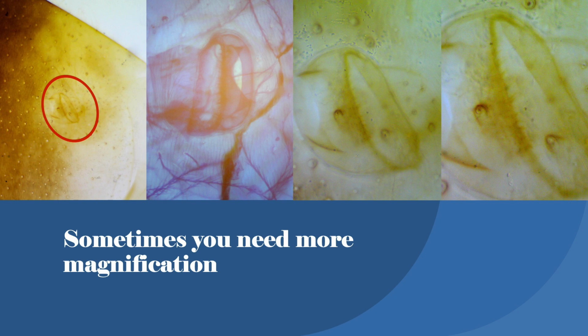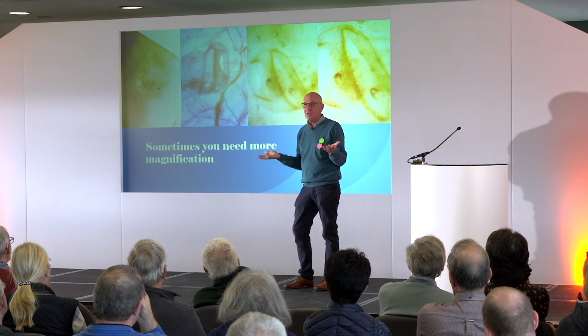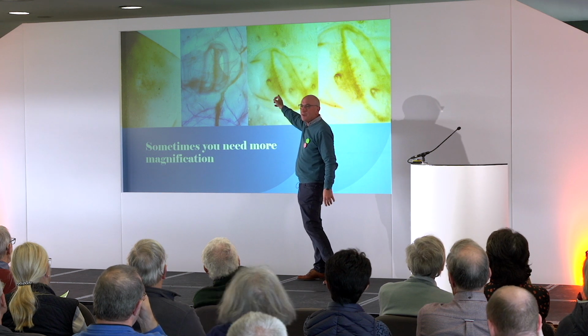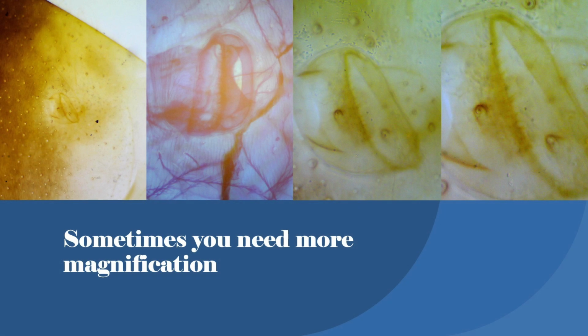The amazing thing is, when you look at a bee, we all know a bee is hairy, but hairs grow everywhere. They grow out of their eyes, they grow out through their spiracles, they grow absolutely everywhere, and that's what we have. And also, some of these will be sense organs.